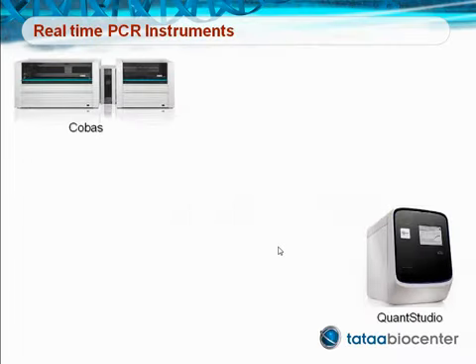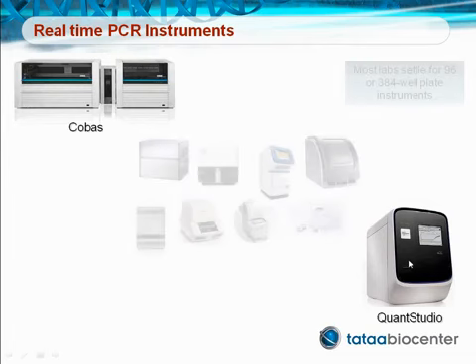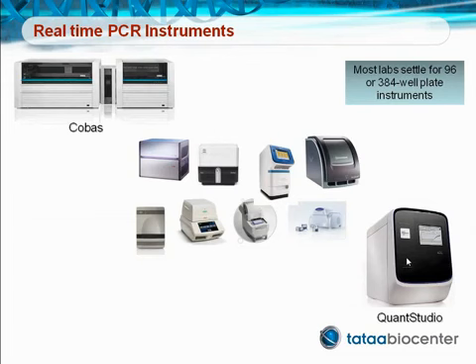Today's instruments are much more user-friendly and typically smaller. There are impressive dedicated instruments such as the cobas TaqMan from Roche for clinical diagnostics and the QuantStudio from Life Technologies for high throughput expression profiling and digital PCR. But most labs settle for any of the 96 or 384 well plate instruments that are open and flexible platforms. These are available from a large number of suppliers.